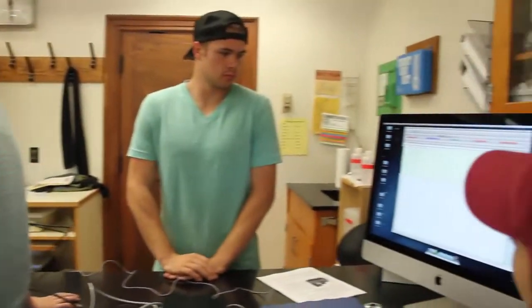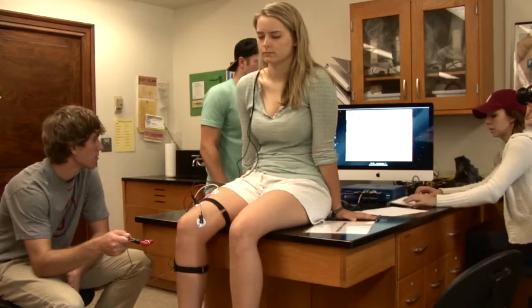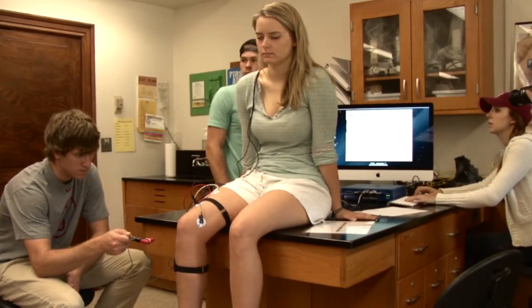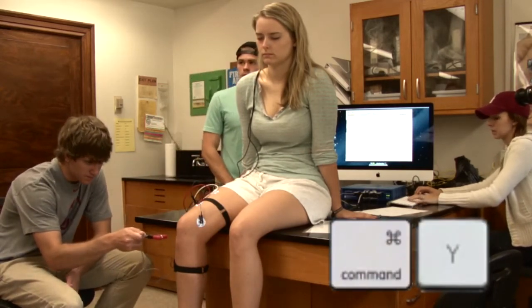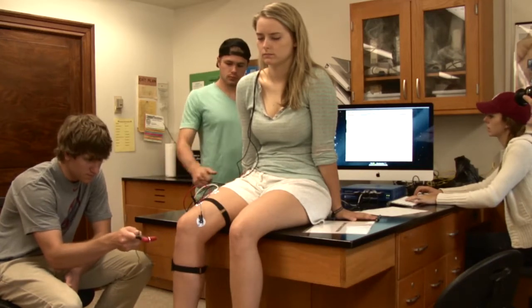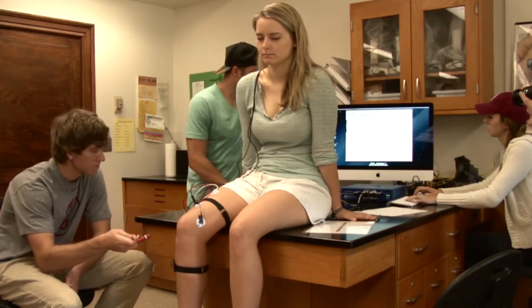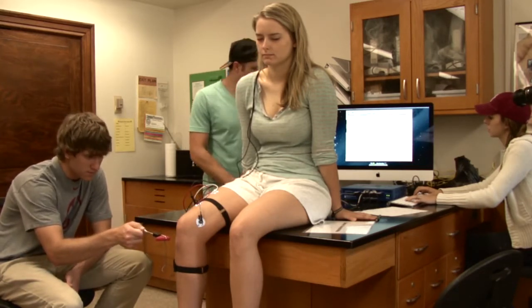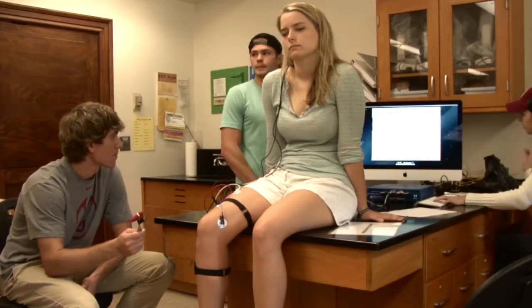Alright, so everybody knows their jobs. Let's see how you do. Danielle, that was a very small reaction, so on the next one I want you to hit Command Y so you can vertical auto-scale automatically.